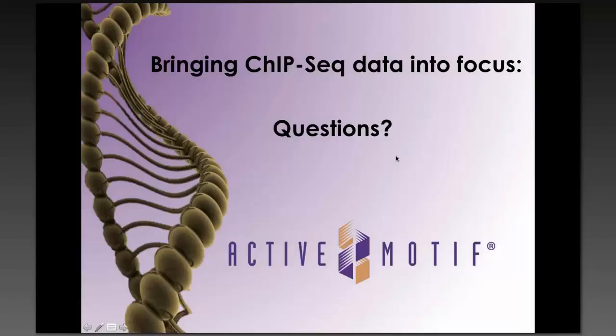This question is, what if I pooled multiple inhibitor-treated IP reactions to get a comparable amount of starting DNA relative to the control IP? Would that eliminate the need for a spike-in? Well, in that scenario, you would see presumably the same result, right? Because you'd be artificially eliminating the difference by adding more. And so there, I think you wouldn't see any change.